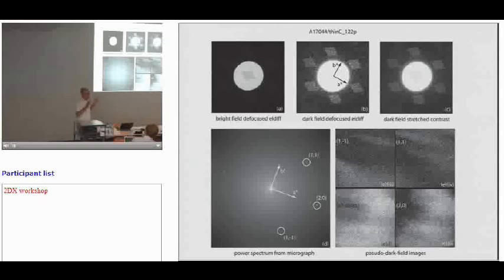So we've spent years trying to get this to be fixed. One of the things we tried is spot scanning, and that definitely makes an improvement because you're only illuminating little areas at a time. We also had this Medipix zero noise detector, so instead of one image, you take 400 images. Shouldn't be moving. And we found both of them improved it.